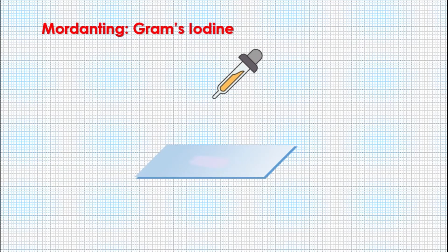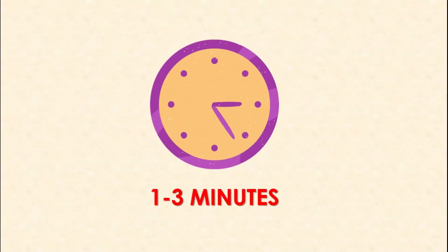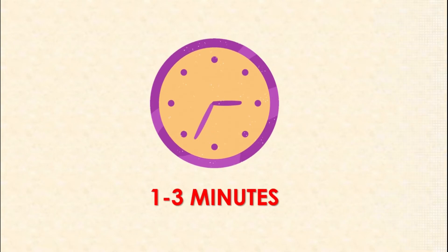In the second step, add Gram's iodine solution and allow it to act for one to three minutes, maximum three minutes. After adding the mordant, that is Gram's iodine, it will form the crystal violet-iodine complex in the bacterial cell. Wash it after three minutes under tap water.